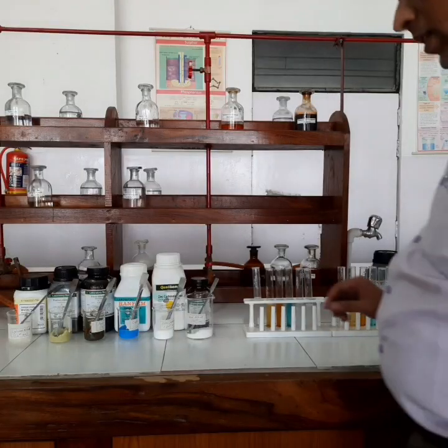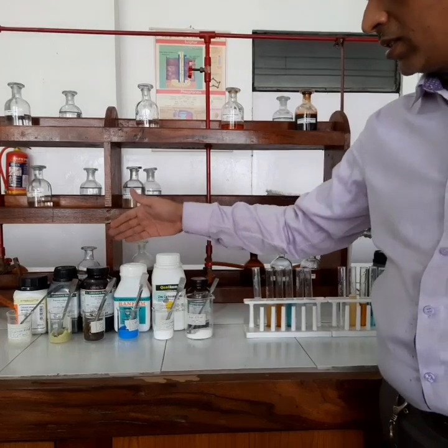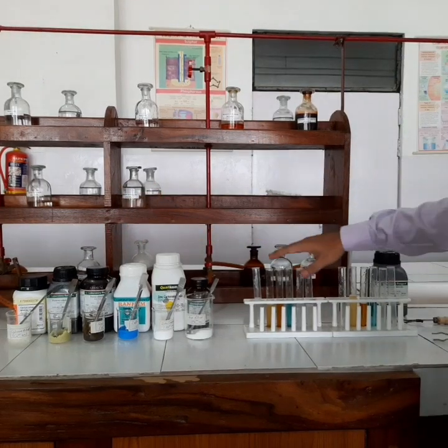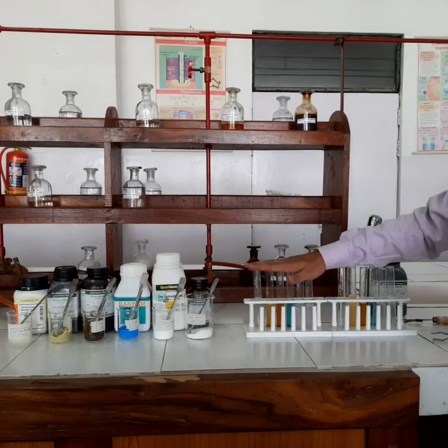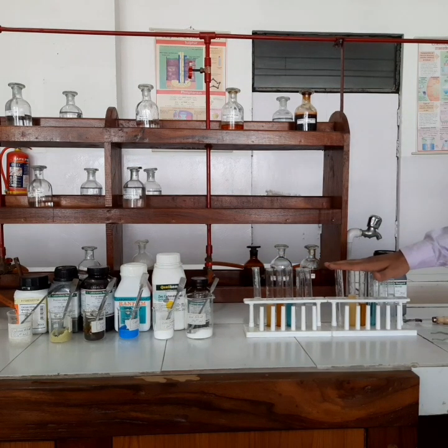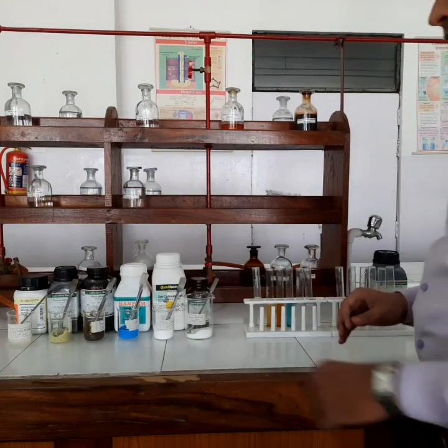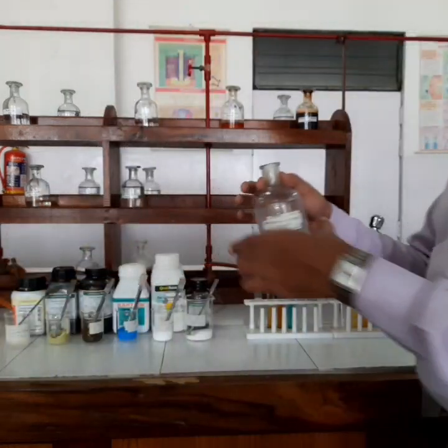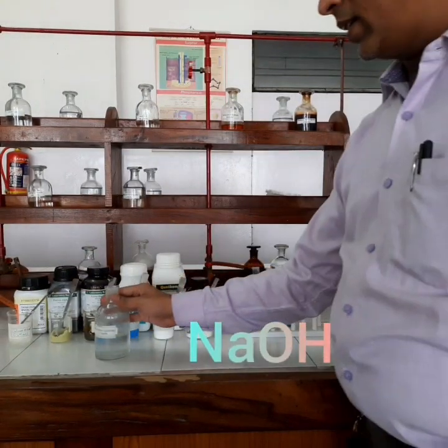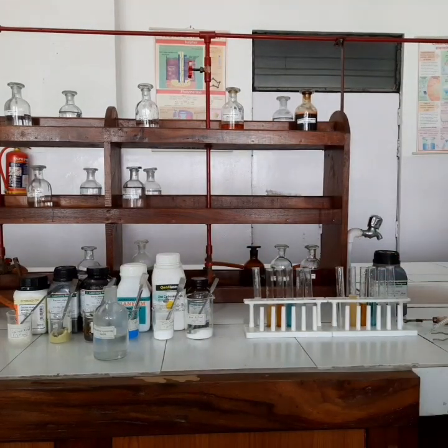For saving our time, I have taken the aqueous solutions of these salts, like calcium, ferrous, ferric, copper, zinc and lead, and I will be testing one part of these aqueous solutions with NaOH, and the other 6 aqueous salts of these ions with NH4OH. So first of all, I am going to take NaOH. Here I have got NaOH, and I am going to add this NaOH to all these salts, first in limited quantity and then in excess.